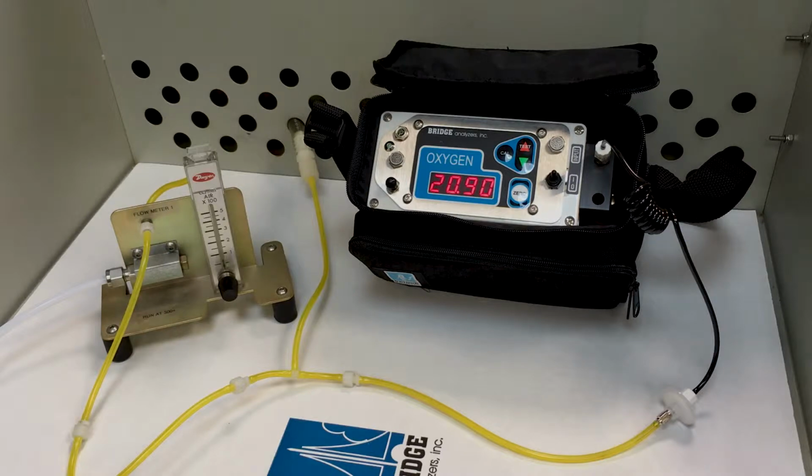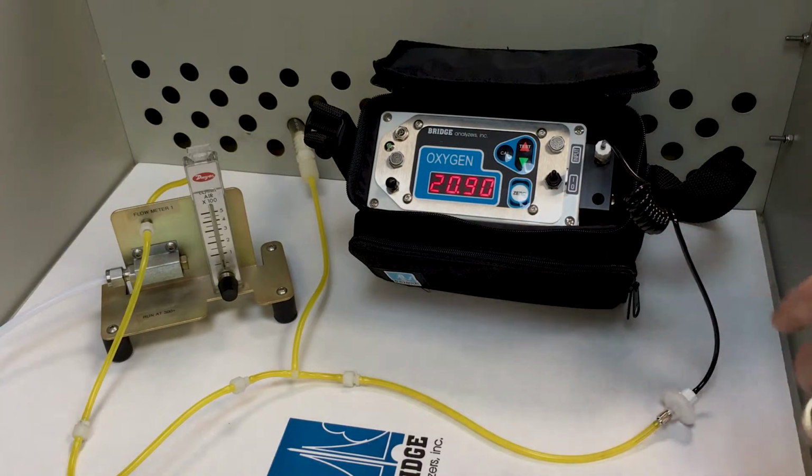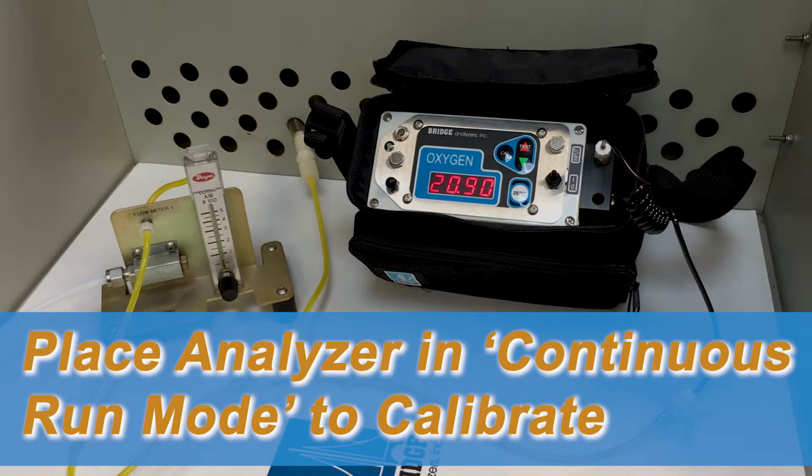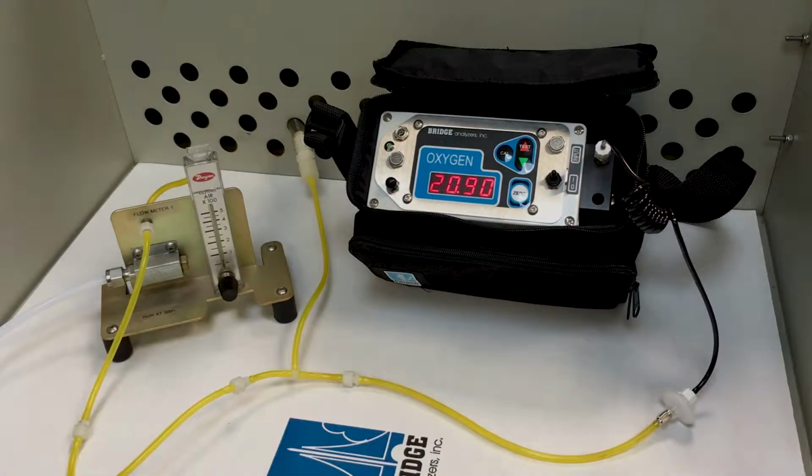So initially what you want to do is have a setup similar to what we have here. I have the analyzer turned on, and I have zeroed the analyzer, and it's running in a continuous mode. That's very critical when you do calibrations. The analyzer must be in the continuous run mode. If you're in the test and hold mode, it will not go into calibrate.